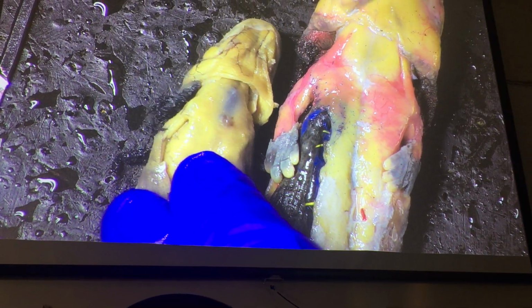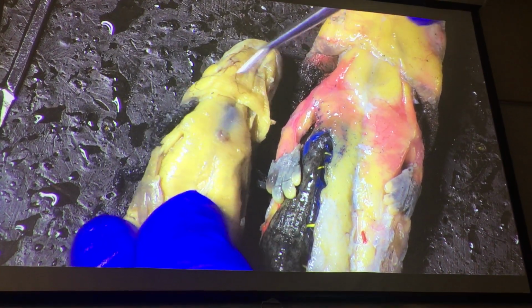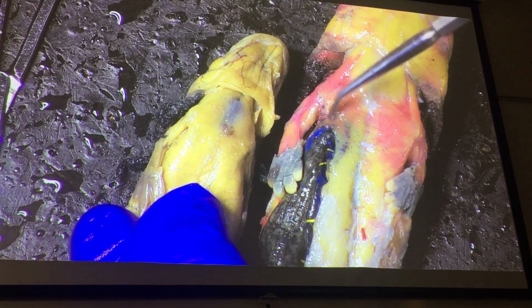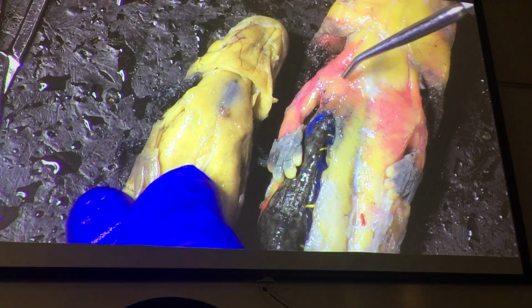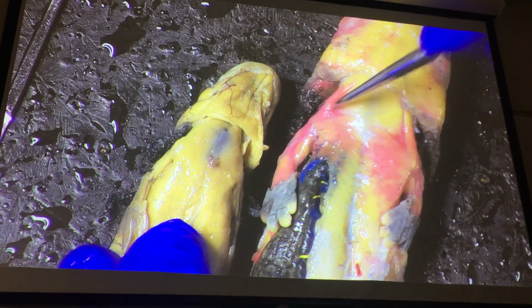Okay, so here we are on the neck, rectus cervicus. Here we are on the chest. This is the supracoracoideus on the coracoid plate. Behind it we have our pectoralis. All right, pretty straightforward. This is the procoracohumerus.